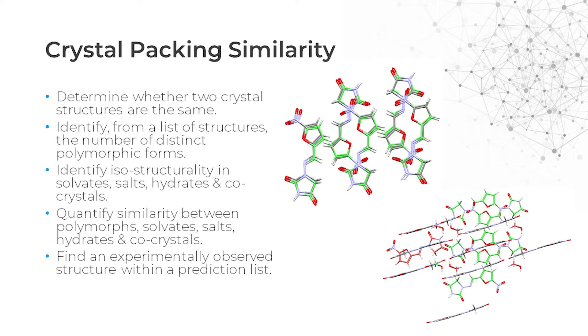This tool can be used to separate polymorphs from a list of crystals of similar molecular makeup and identify isostructurality in solvates, salt hydrates and co-crystals. It can also be used to find an experimentally observed structure from within a list of predictive structures. Let's have a look at how to use it.